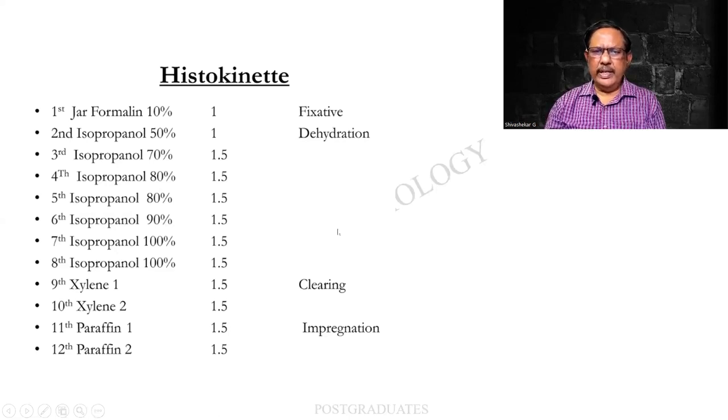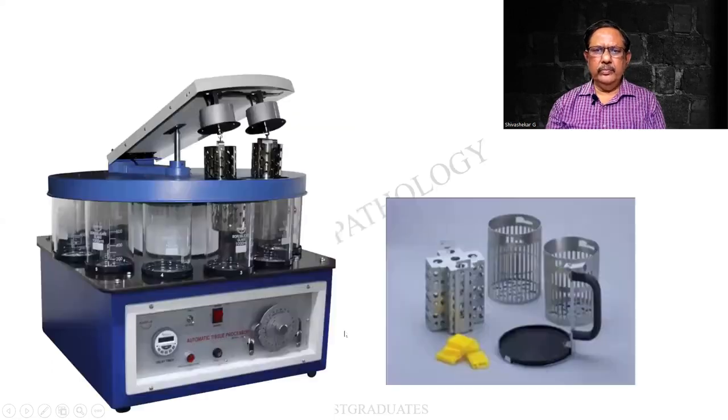The various stages are again mentioned over here. And look at this one. This again, I would like you to appreciate. I will be repeating this n number of times so that it percolates your mind. This is called the pivot. The pivot is something that can uplift it. And there will be radiating arms called the levers.